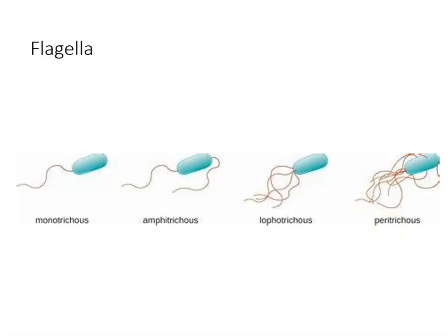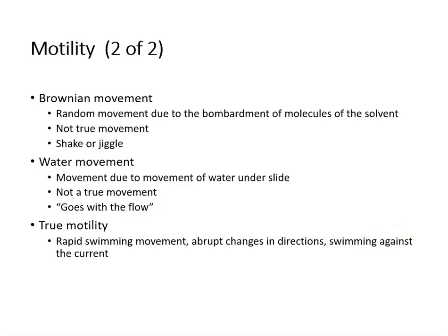All right. So the other thing that we look at is when we put a drop of water with this little organism. Basically, you can pick up the organism, put a drop of water on the slide, mix it up, and look at this. You've got to be pretty quick under the microscope because it does dry. But there are several things that we're looking for when we put this underneath the microscope.